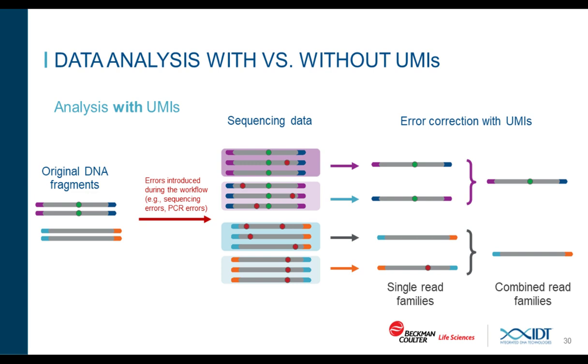Improper handling of blood can result in gDNA contamination. Delay in processing of these tubes, especially the EDTA tubes, will cause cell lysis and gDNA release into plasma. The incomplete removal of these cellular components can also result in gDNA contamination. Frozen whole blood can also cause significant cell breakage and gDNA contamination. So if these steps are avoided, then the gDNA contamination will be less in the sample.